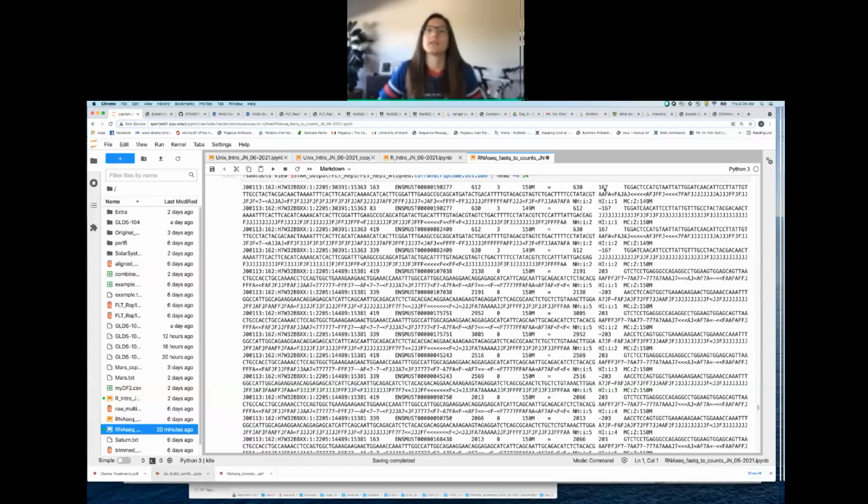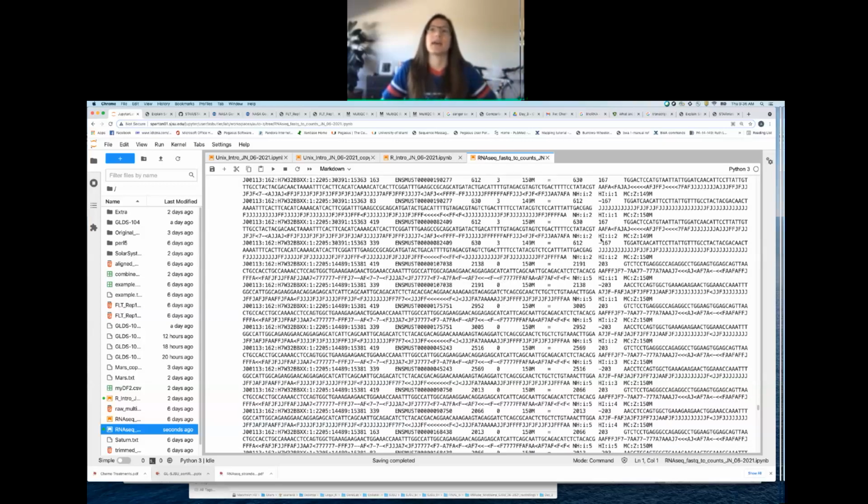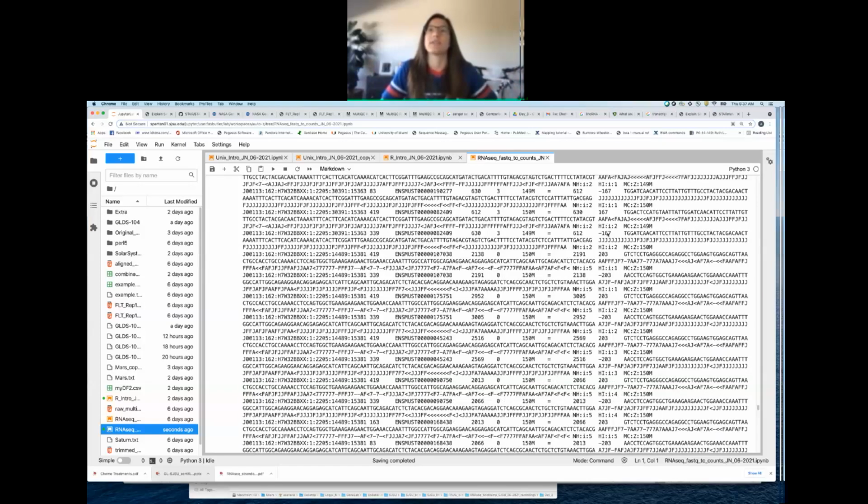So if this is positive, what does that mean? It has to do with the orientation relative to the reference strand. Yeah, that's right. Does positive indicate the same or the opposite orientation? Same. Yeah. So a positive value here is going to indicate that this is in the same orientation as the reference. And a negative is, of course, going to be the reverse orientation of the reference. And so we see that this mate pair is 167, the total insert size, and then it's that same mate pair just aligning somewhere different, so still that 167 size.